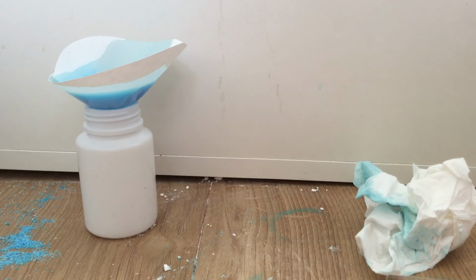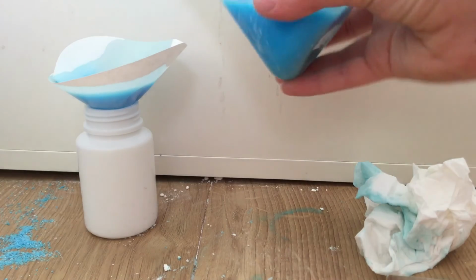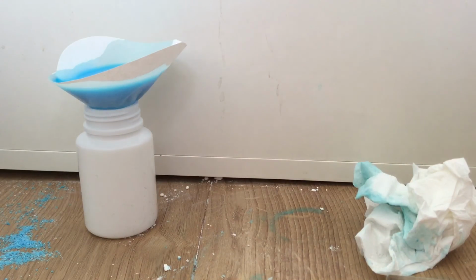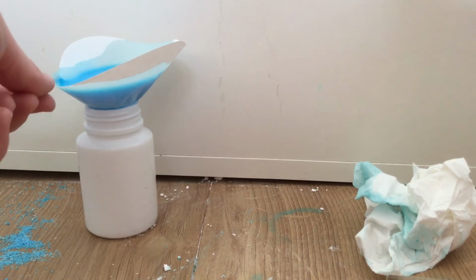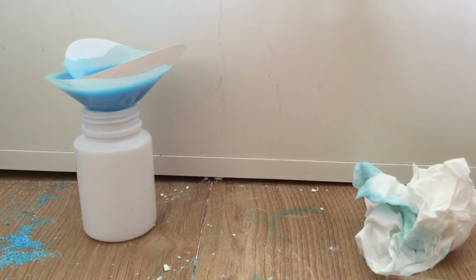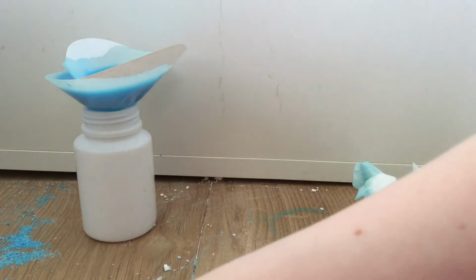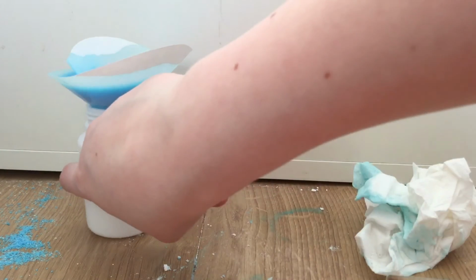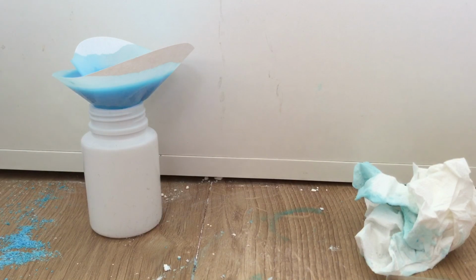This copper 2 sulfate isn't so hard to come across. You can find it on Amazon for about £6 for like a kilogram. So yeah. Now you just need to wait for this to filter.